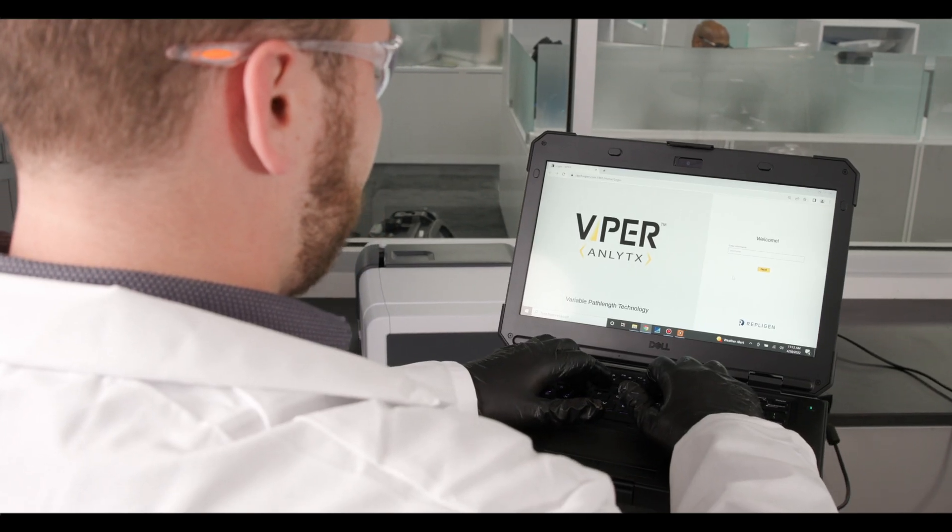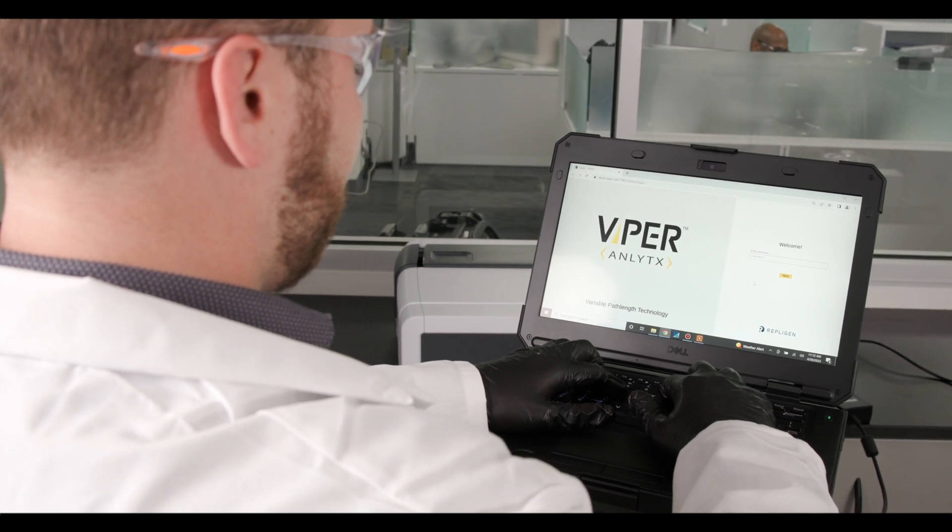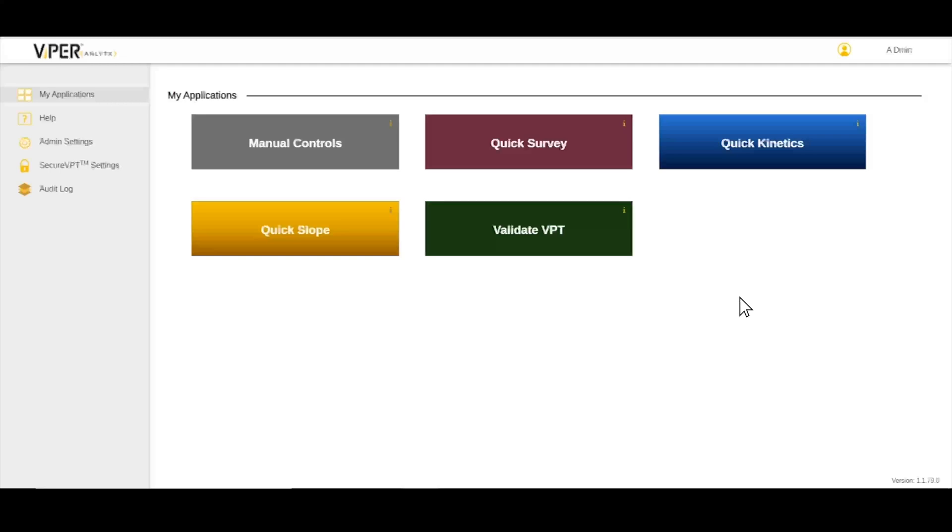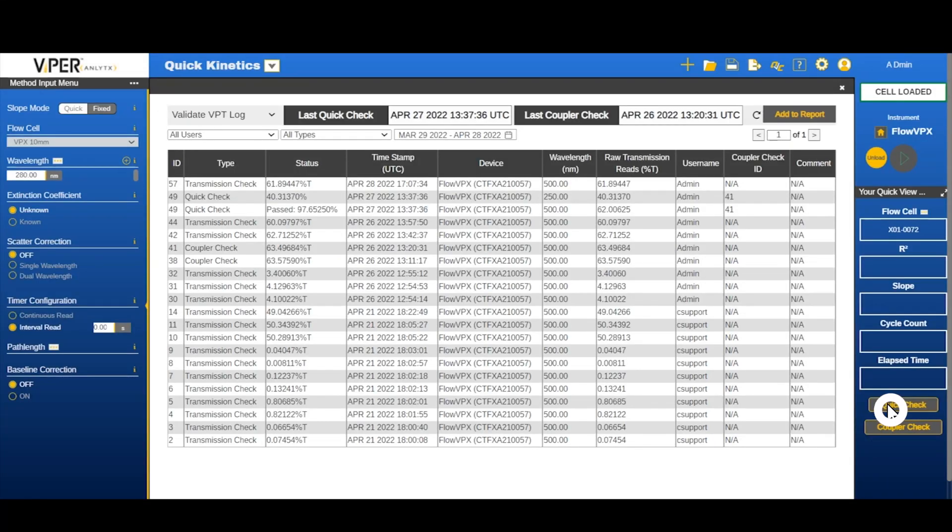If you're planning on performing another run with the same flow cell, initiate the manual transmission check. To perform the manual transmission check, navigate to quick kinetics within the software. Click quick check on the instrument control to start the quick check process.